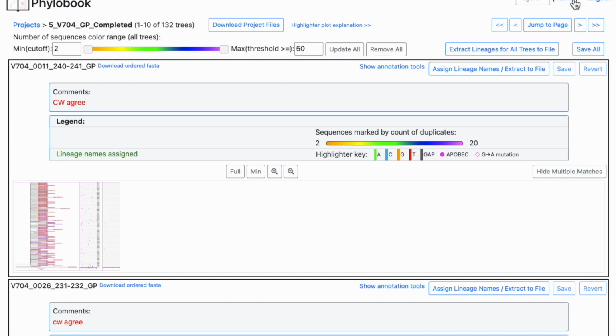Alright, so that concludes right now my initial introduction to PhyloBook and how to use it. In a separate video, I'm going to talk about using these admin tools, installing PhyloBook, and then in another video, we'll talk about how to process your data to bring it into PhyloBook.